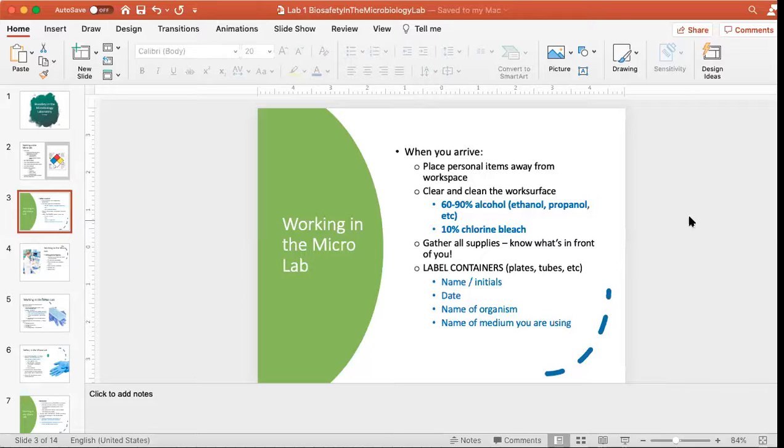We carry stuff with us through the day now, and it's pretty normal for most people to do that. Those are your personal items. And in a laboratory setting, you have to treat those in a very particular way.